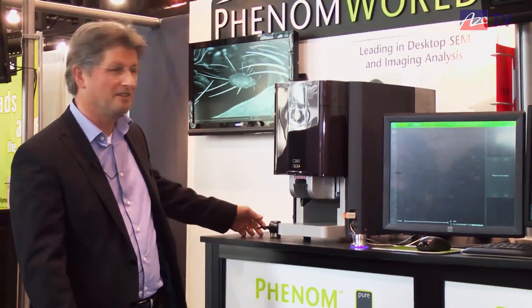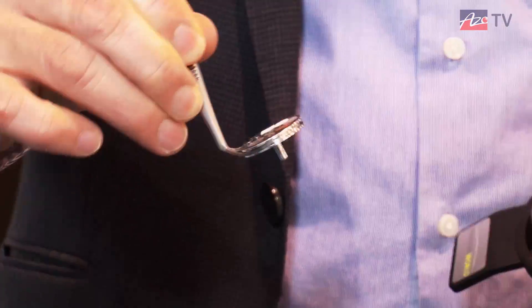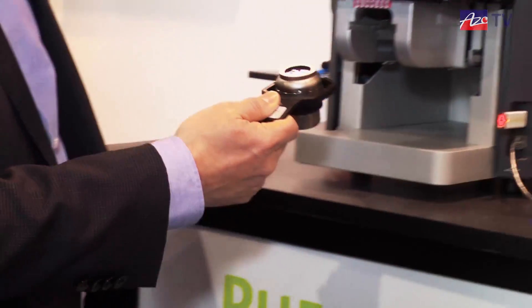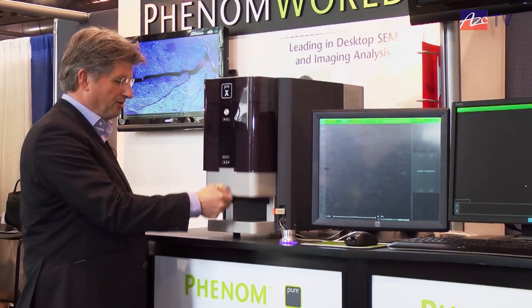So let's talk about the Phenom. This here is the specimen holder. It doesn't look like one, but that is to keep it simple. The specimen is in here. We've made some examples: a toothpick, some mesh, some semiconductor material. We put it in and close the door, and then the system comes to life.